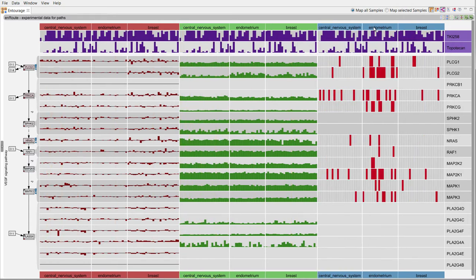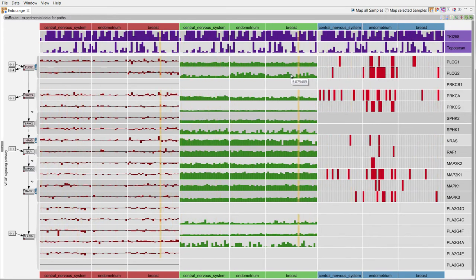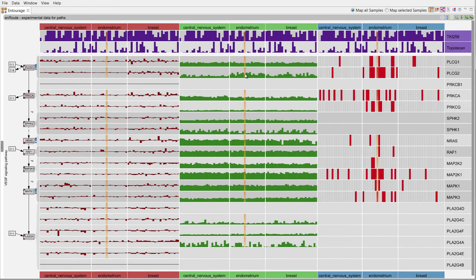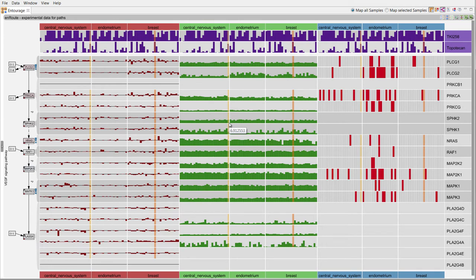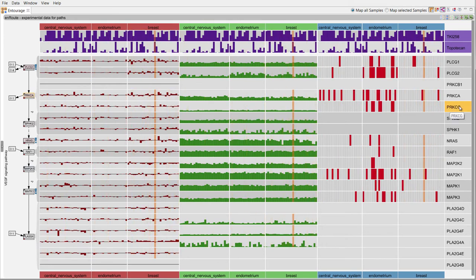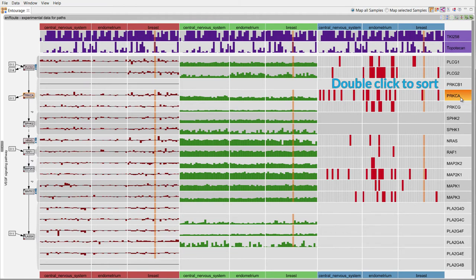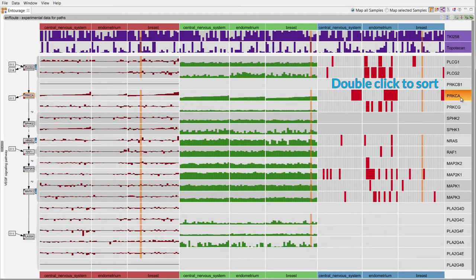To identify all data associated with a sample, we use color highlighting. Sorting the samples by the values of a particular row makes data correlations easier to spot.